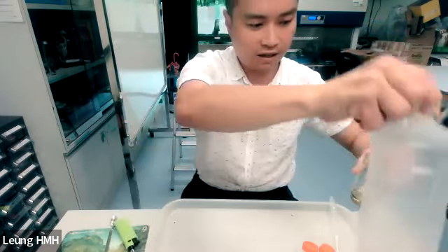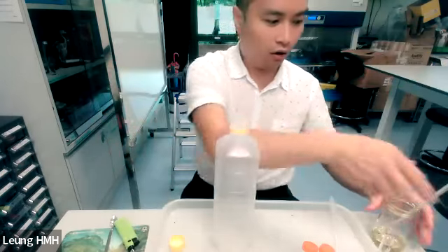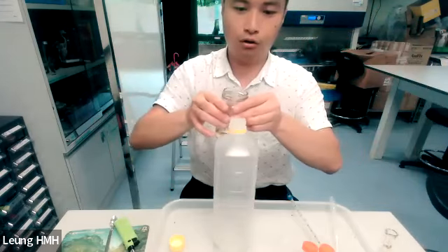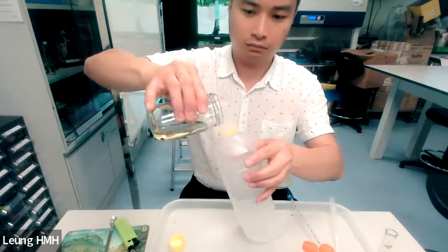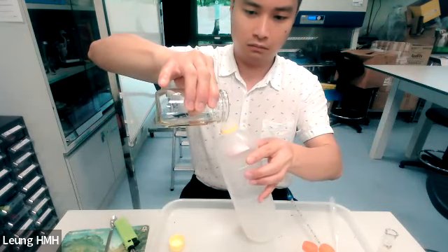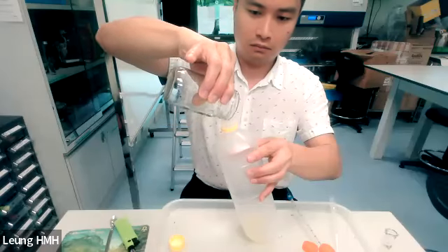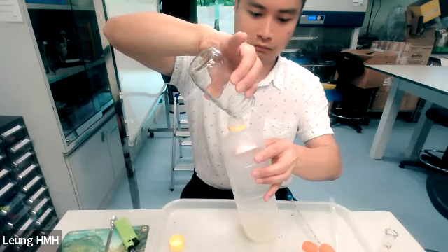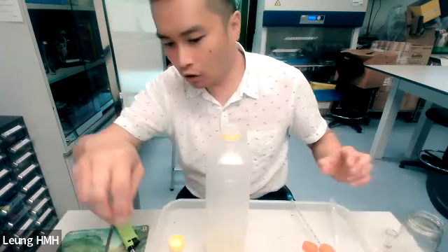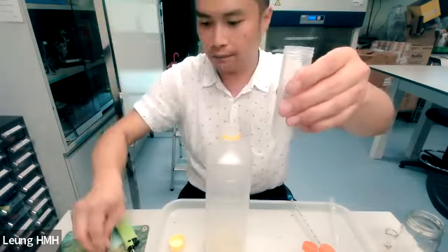Okay, now we try to transfer the oil into the container. And also we try to add the catalyst. As I mentioned, this is sodium hydroxide.